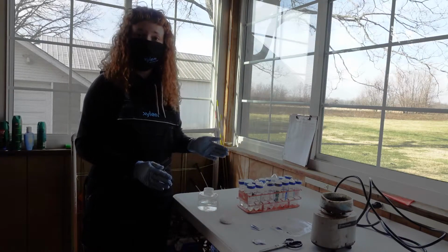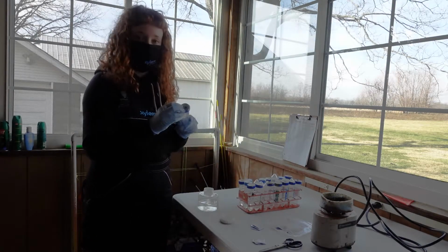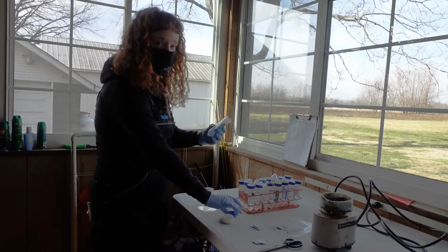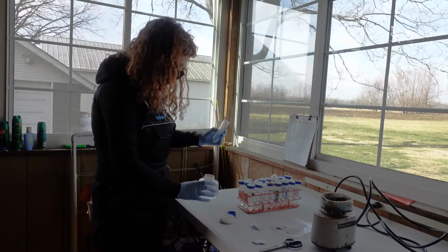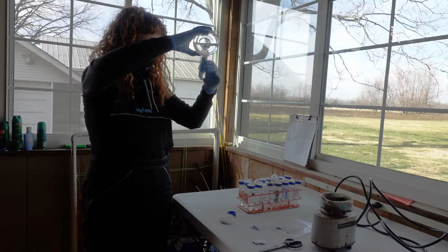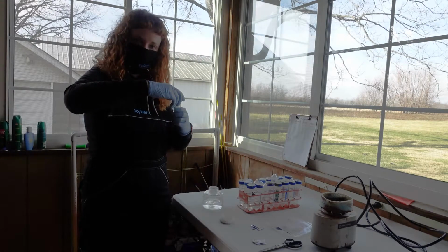For sample number 1, remember I have a duplicate and a spike. So I'm going to do this again for my tube labeled 1D. Same thing, pour to the mark 25. Cap it.